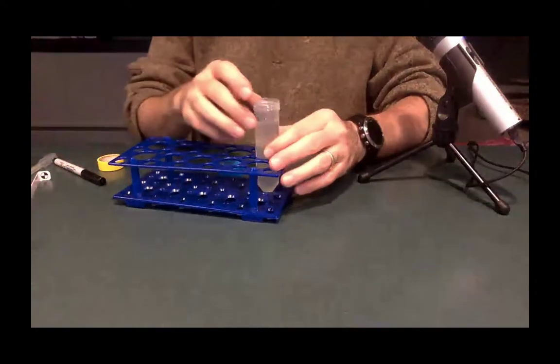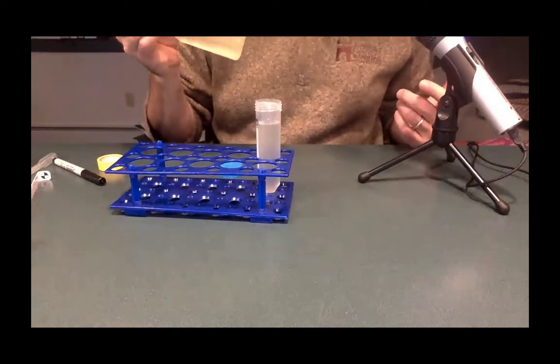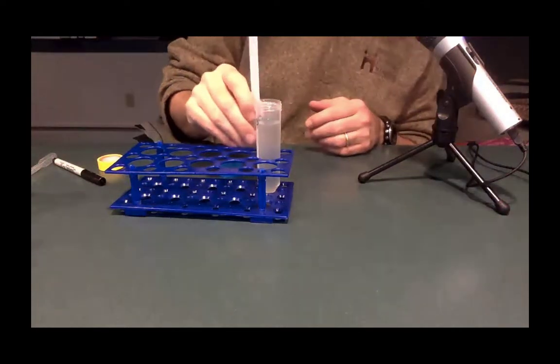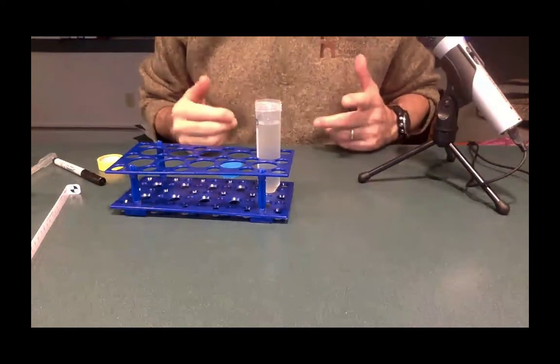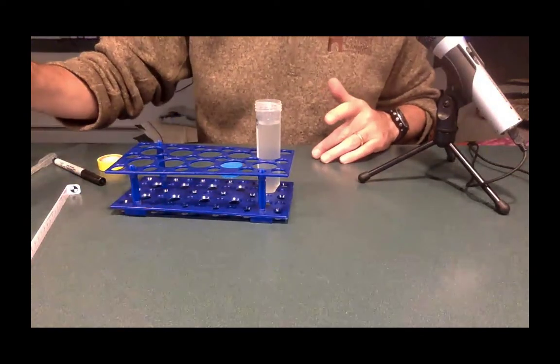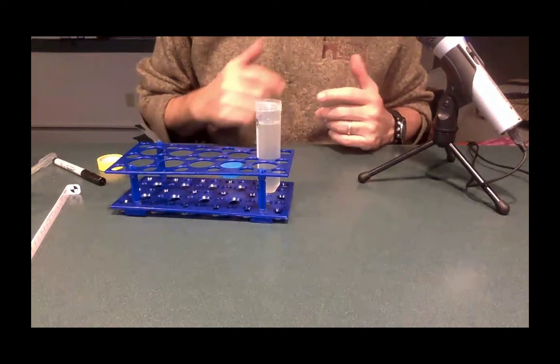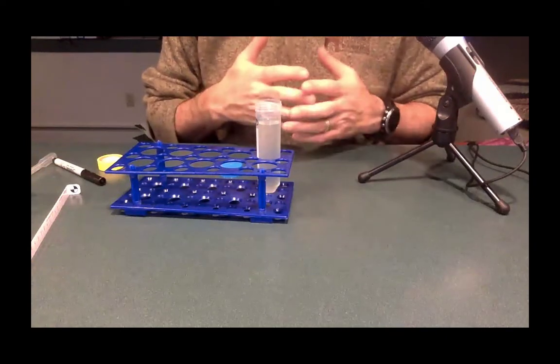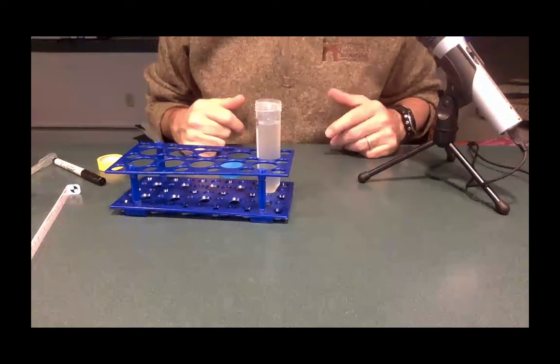Now, will your initial readings be different than mine? Absolutely. Could you do a lot less algae to start? I mean, that's only about halfway down this tube. Maybe you're like, oh gosh, that's not very far down. Maybe I want to use less than that. You can pick whatever amount of algae you want to start. You may run this experiment and realize, well, there really wasn't much of a difference. Maybe if I started with less algae, I would be able to get a stronger reading over time. That's just how I decided to set this up for the first time.